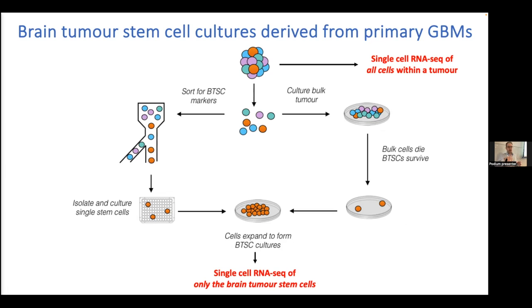So very different from the myeloma experiment. Myeloma experiment, we're grinding up and sequencing every single cell. This is the exact opposite, where we knew the cell population we wanted to go for. So we went through all this trouble to isolate the cancer stem cells specifically.